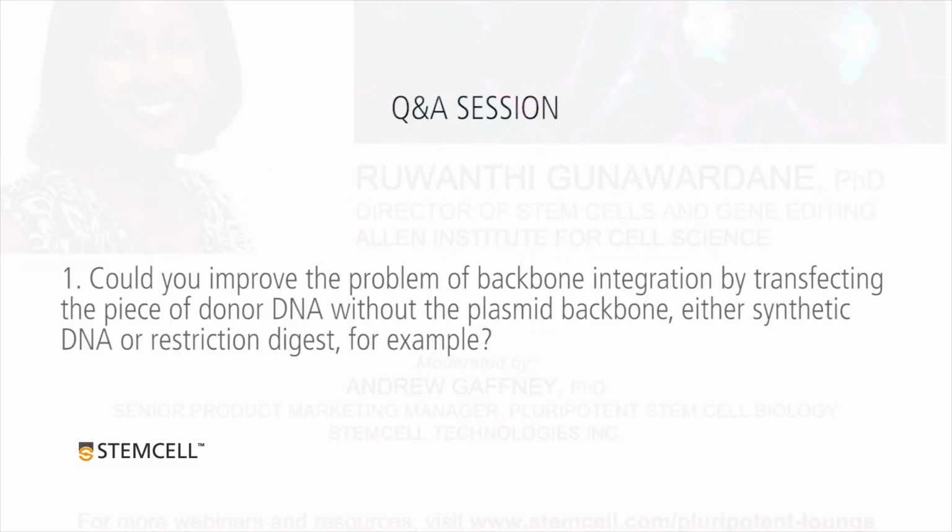Could you improve the problem of backbone integration by transfecting the piece of donor DNA without the plasmid backbone, either synthetic DNA or restriction digest, for example? Yes, so that is difficult to do, and that might get incorporated too. But that is a very good question.